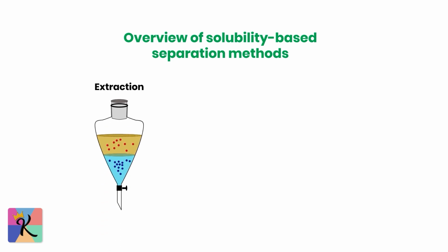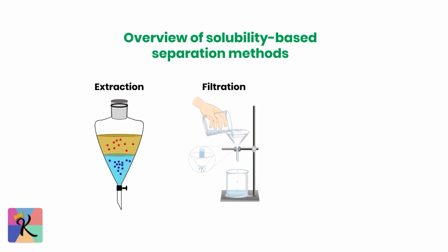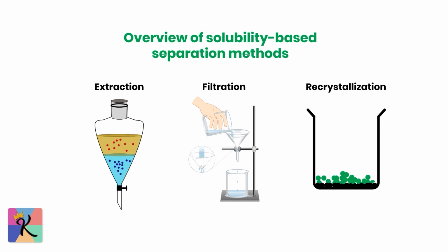So there you have it, a comprehensive overview of solubility-based separation methods. Whether you're extracting a compound, filtering out a solid, or purifying crystals, these techniques are essential tools in the chemistry lab. Understanding how and when to use each method can greatly enhance your ability to isolate and purify compounds effectively.